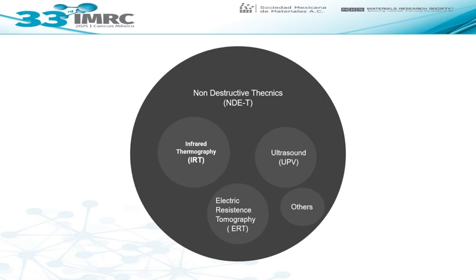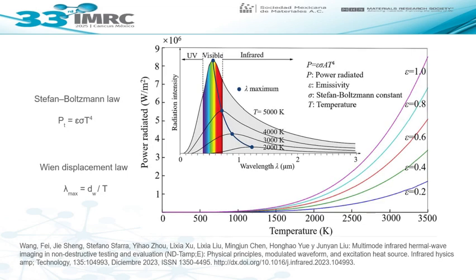Well, IRT works thanks to the Stefan-Boltzmann law. This law states that the radiated power of a body is related to the temperature of this body.